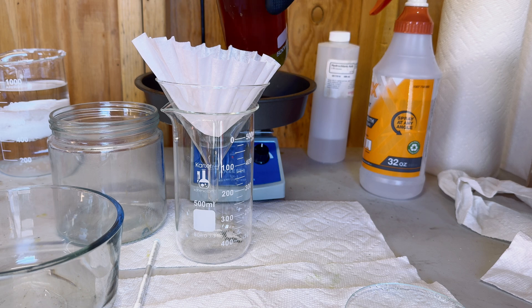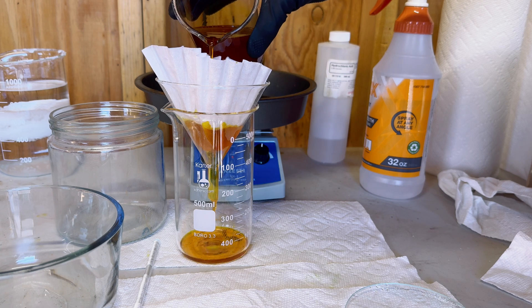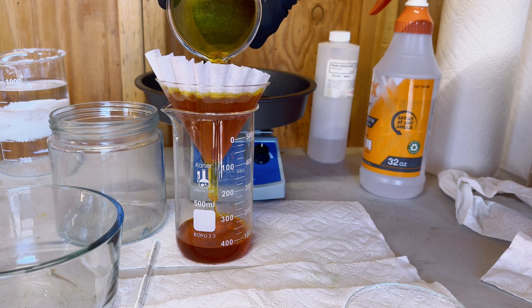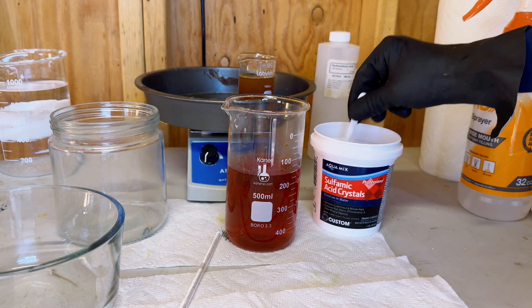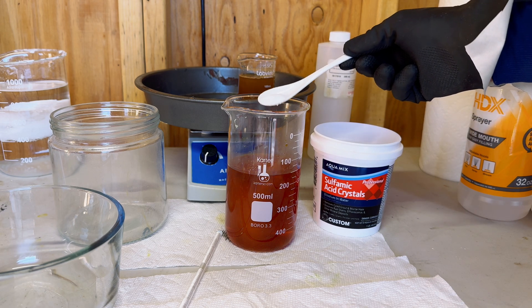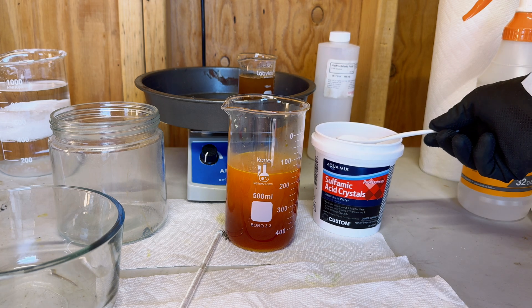Now we are going to filter our aqua regia, and I would like you to take notice of how dark this aqua regia is. I've never had aqua regia this dark before in any material that I had run. Now we are going to add in our sulfamic acid to denox or neutralize our aqua regia. I don't measure my sulfamic acid, but I just keep adding sulfamic acid in until the reaction stops in the aqua regia.